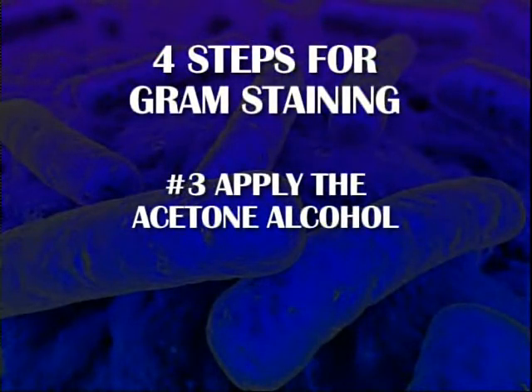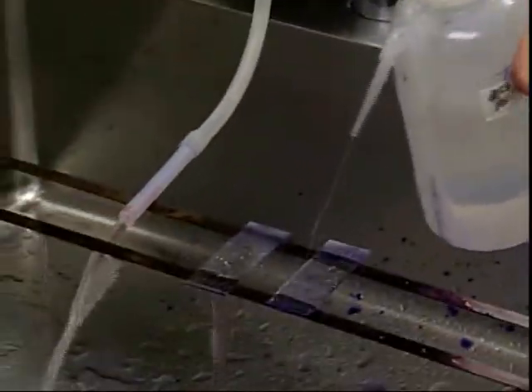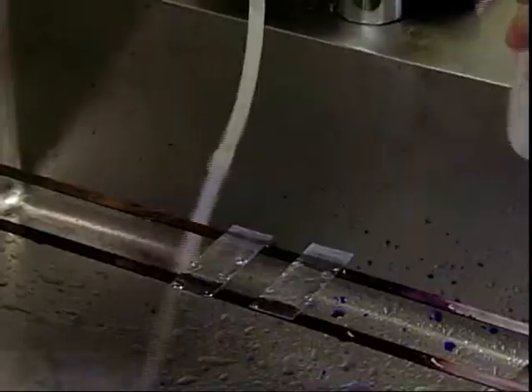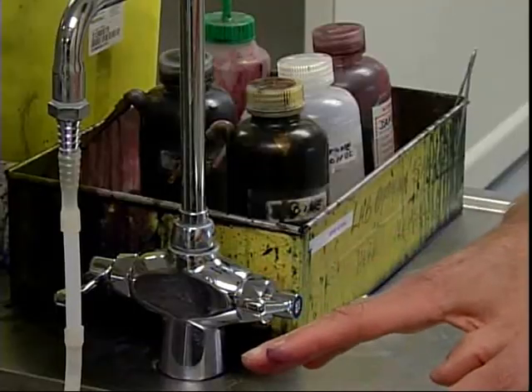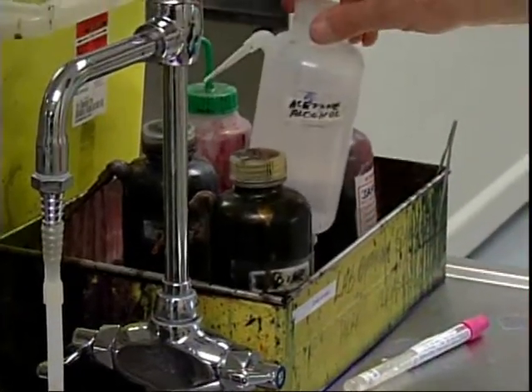The third stage, and the most critical stage, is to use acetone alcohol to decolorize the slides. We put this on briefly, and this will take off the excess crystal violet that is present. So that at this point in the procedure, all the gram-positive organisms will retain the crystal violet stain. The gram-negative organisms have been decolorized by the acetone alcohol.